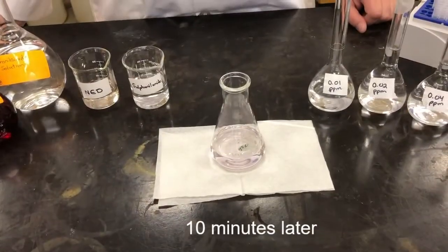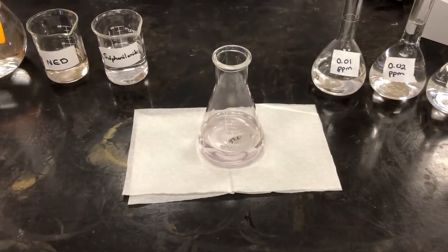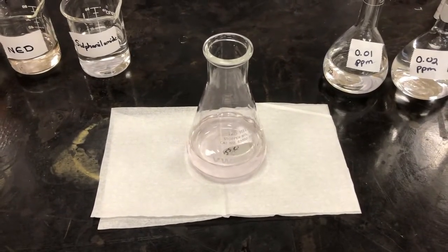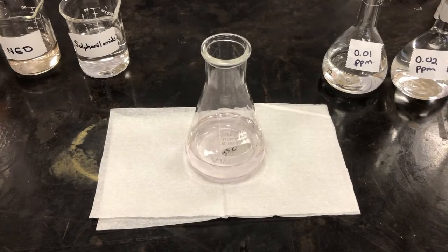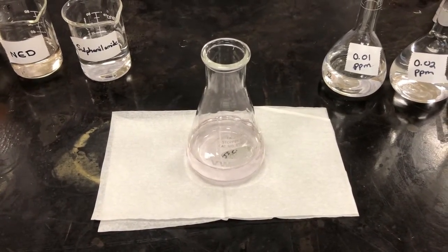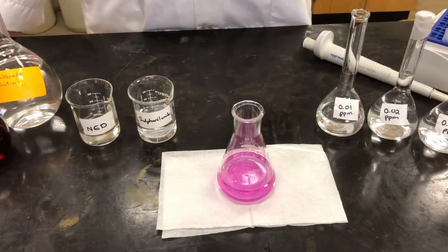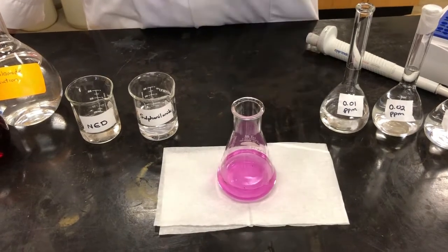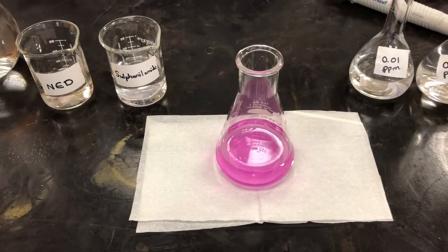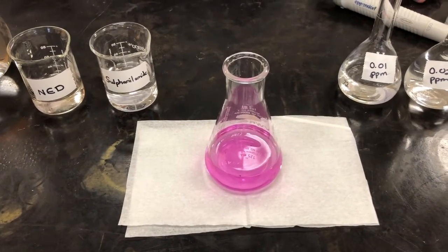So 10 minutes have passed, and you should be able to see now in our flask this very faint light pink color. That's the color of the azo compound we're looking for. And we should see, as the concentration of the nitrite in the standards increases, that the intensity of the color will increase as well. So just wanted to show you the highest concentration of standard. This is the 0.20 ppm, just so you can see the difference in the color. This is the highest concentration of nitrites, and you can see we have a really bright pink color there.